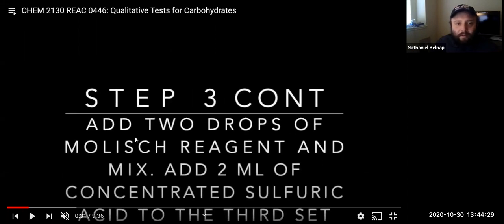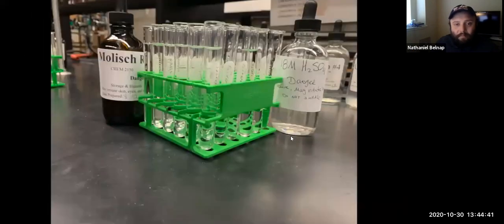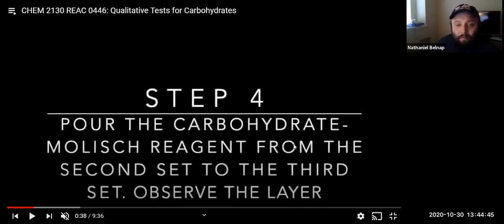So add 2 drops of MOLISCH reagent and mix, and then add 2 mils of concentrated sulfuric acid to the third set. Pour the carbohydrate MOLISCH reagent from the second set to the third set. Observe the layer.